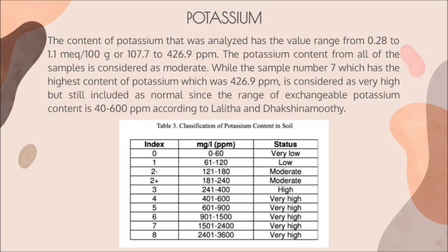while the seventh soil is substantially higher than the others, with the highest potassium content, which was 426.9 parts per million.